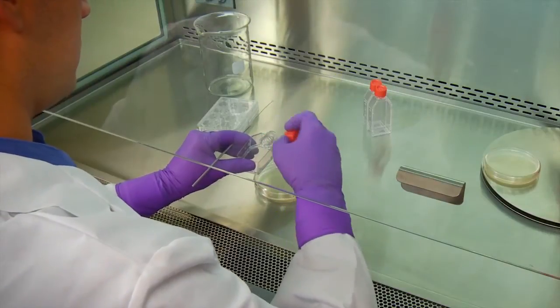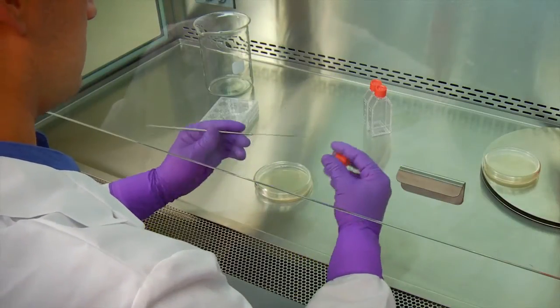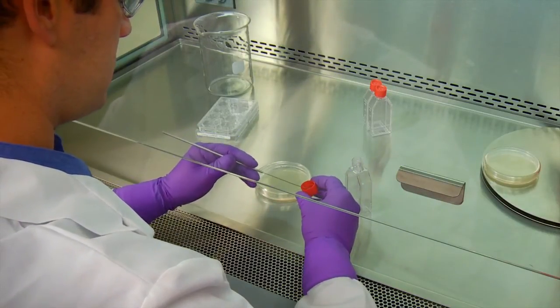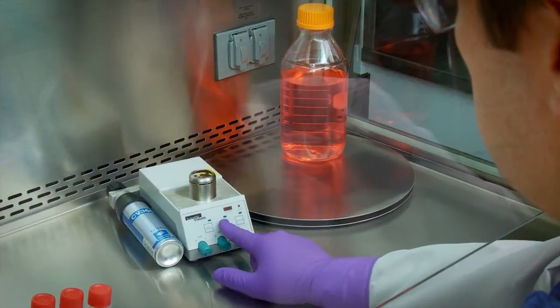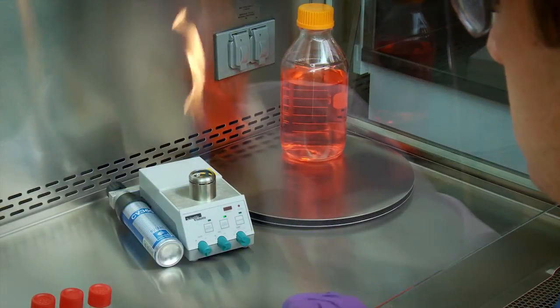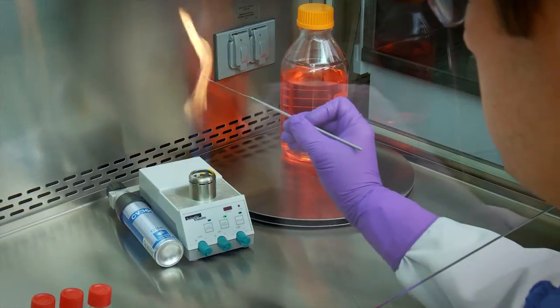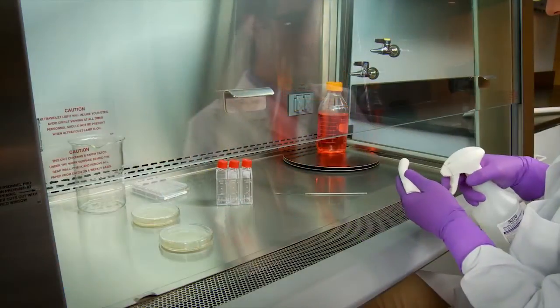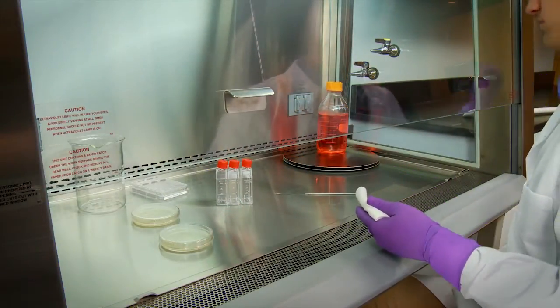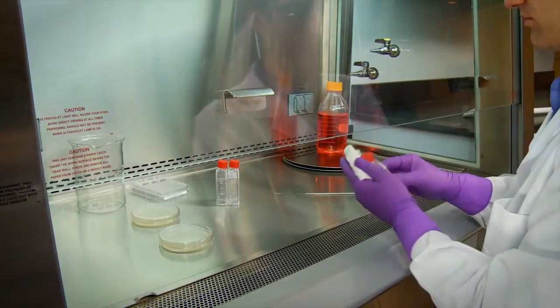From the earliest laboratory acquired infections to the hazards posed by today's antibiotic resistant bacteria and rapidly mutating viruses, threats to worker safety have stimulated the development and refinement of cabinets in which infectious microorganisms and potentially harmful aerosols could be handled safely.